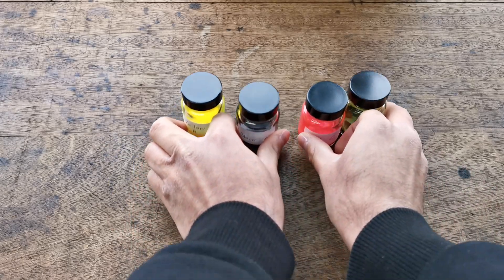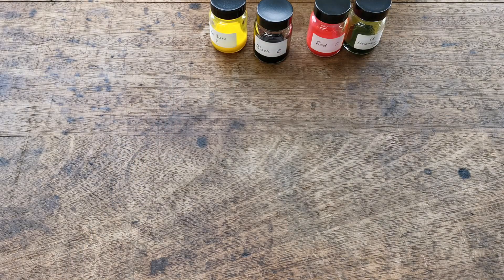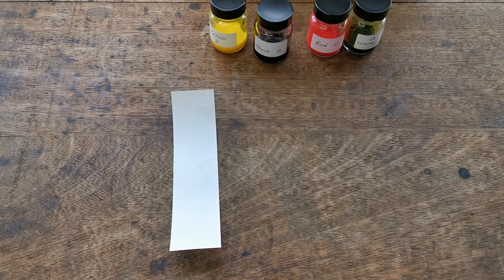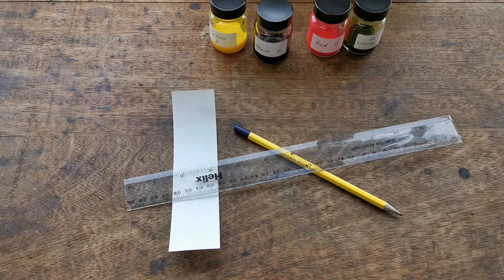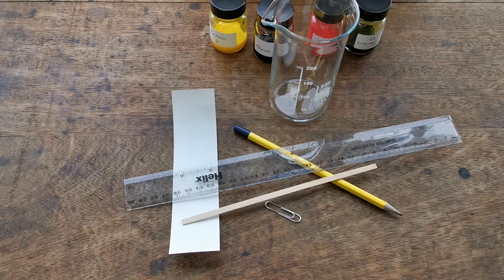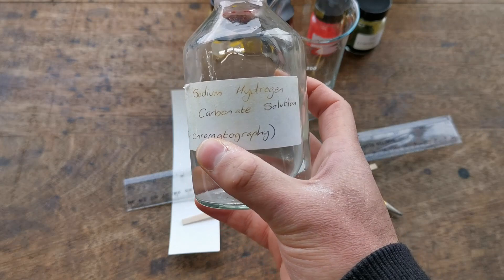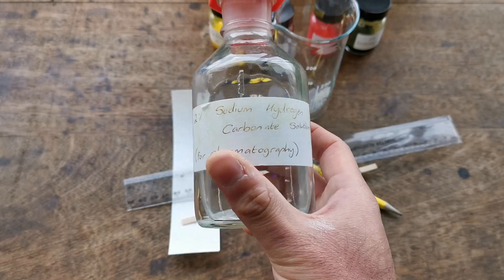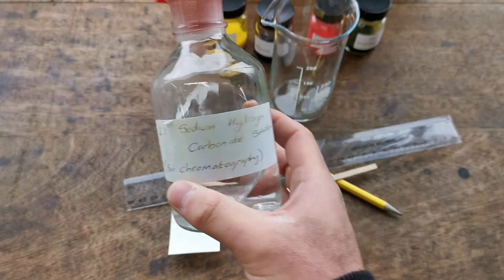To set up your chromatogram you're going to need some chromatography paper — this is just filter paper — a pencil, a ruler, a paper clip, a wooden splint, a beaker, and a solvent. In this case we're going to be using sodium hydrogen carbonate, though sometimes water is used, so different solvents can be used.